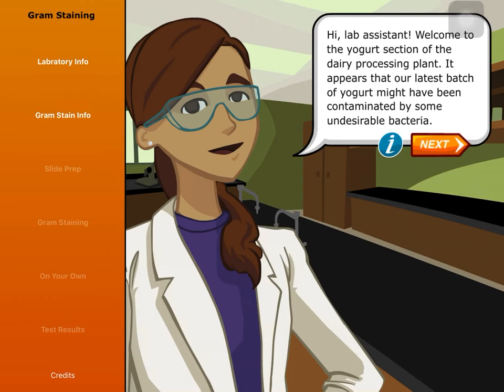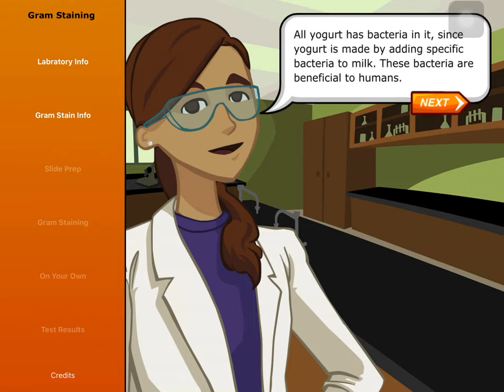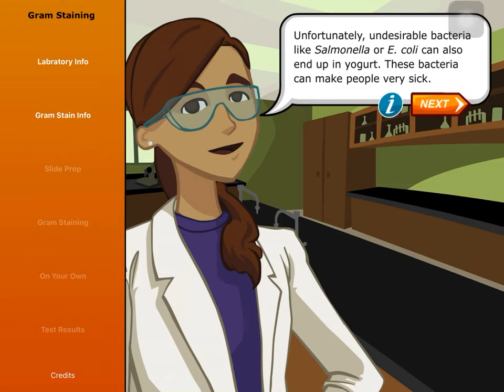Hi, Lab Assistant. Welcome to the yogurt section of the dairy processing plant. It appears that our latest batch of yogurt might have been contaminated by some undesirable bacteria. All yogurt has bacteria in it since yogurt is made by adding specific bacteria to milk. These bacteria are beneficial to humans. Unfortunately, undesirable bacteria like Salmonella or E. coli can also end up in yogurt. These bacteria can make people very sick.